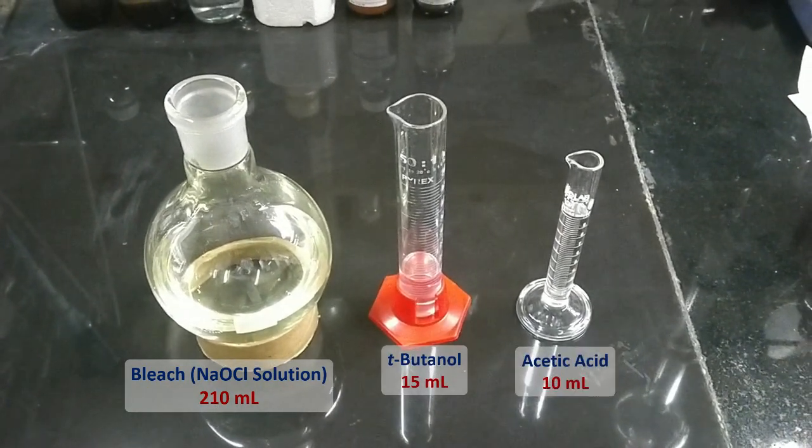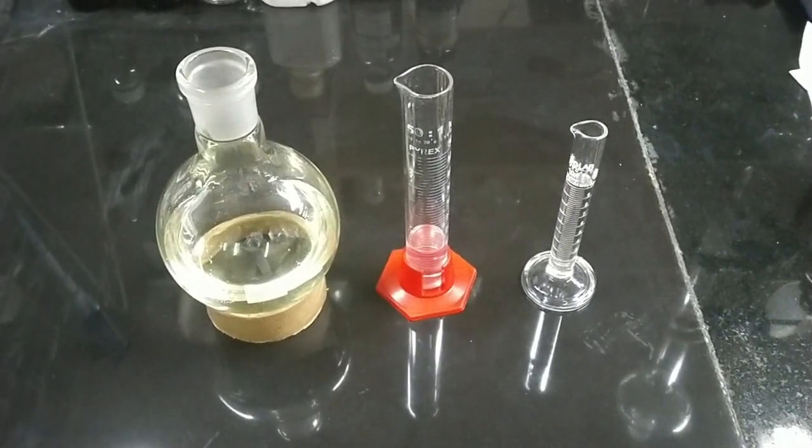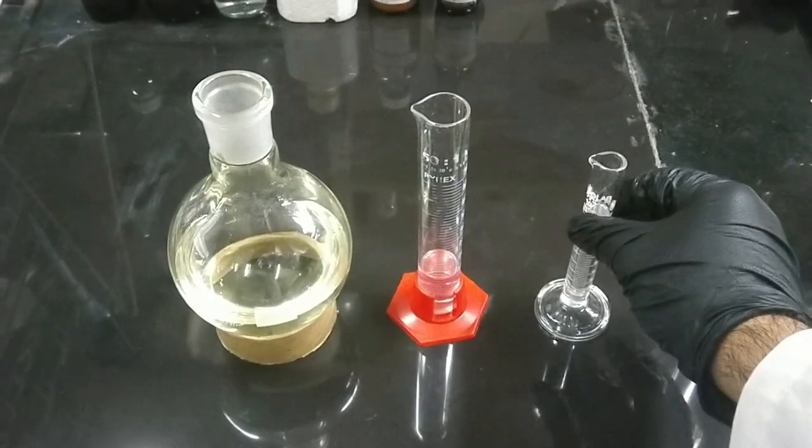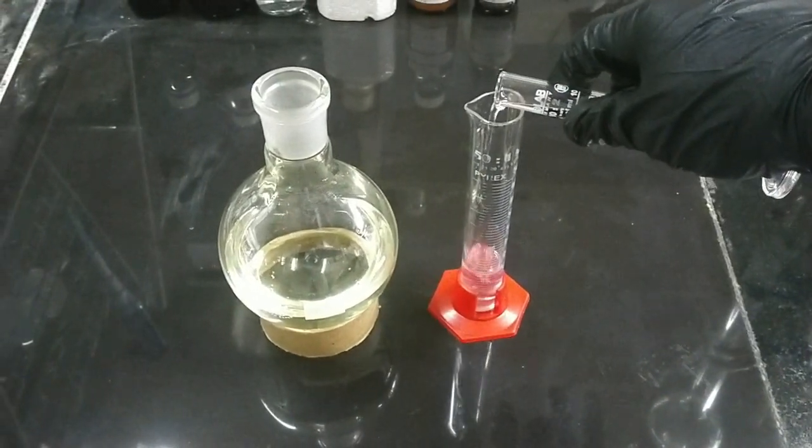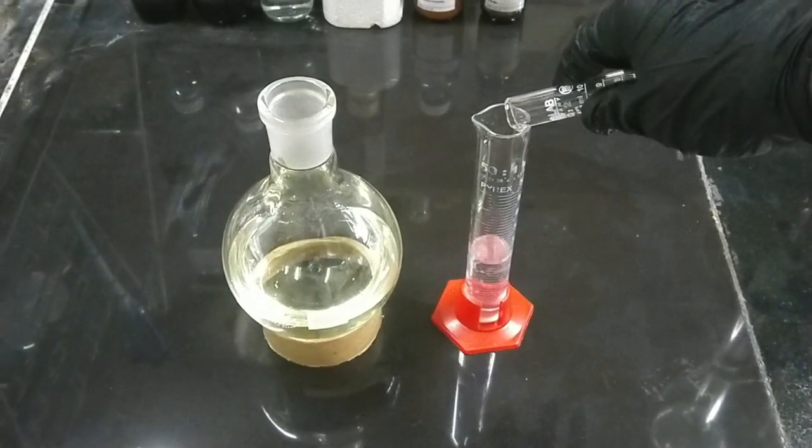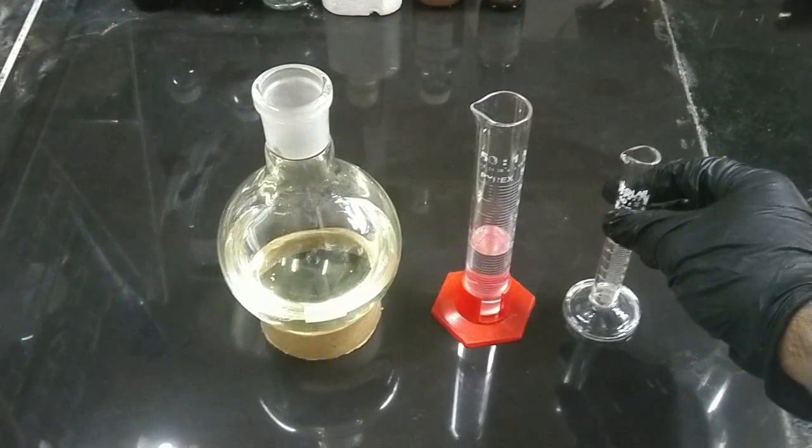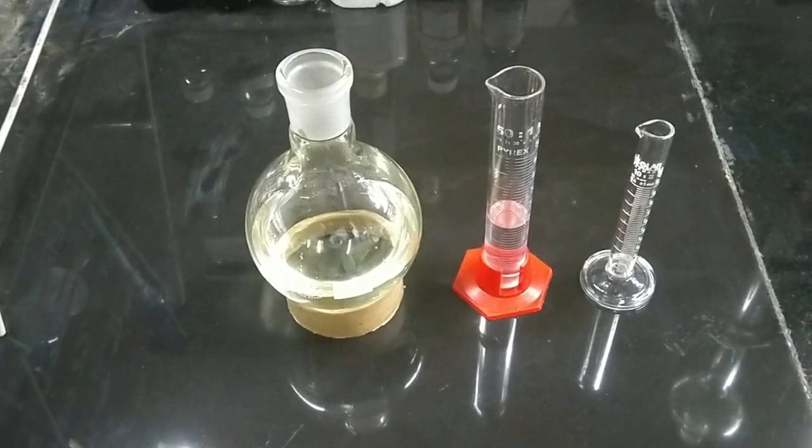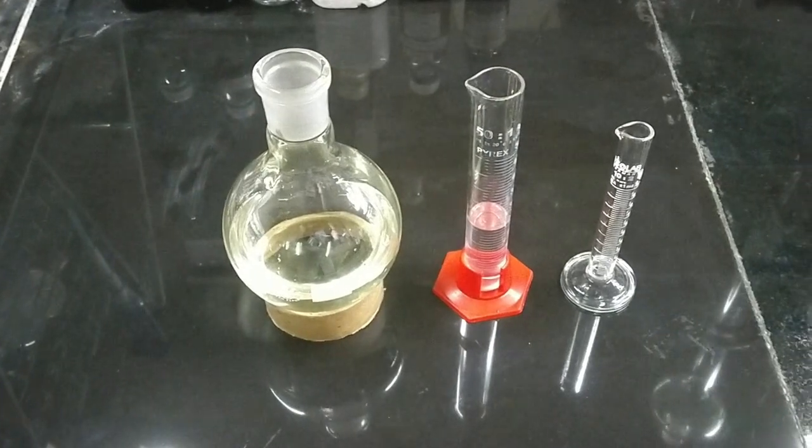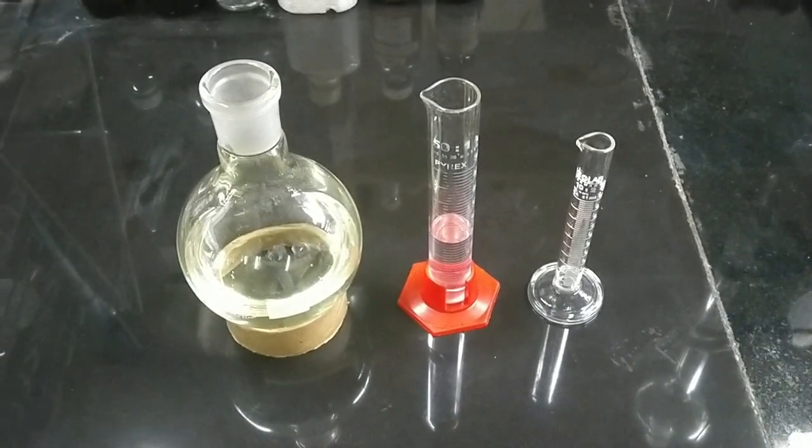In the first step, I'm going to add the acetic acid to the tertiary butanol. Now I have a solution of acetic acid in tertiary butanol. In the next step, I'm going to lower the temperature of sodium hypochlorite, that's the bleach.